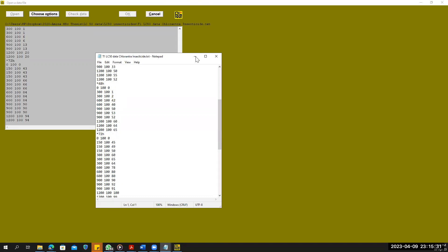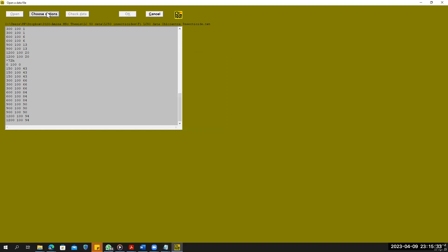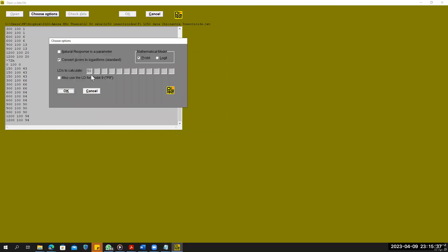Choose the option here. We can use 50% LD50 or any other value. Since we are calculating LD50, we will write down 50. We can write 30, 10, 90 — whatever we want. For the model, Logit or Probit — Probit is preferable for LD50. Then click OK.